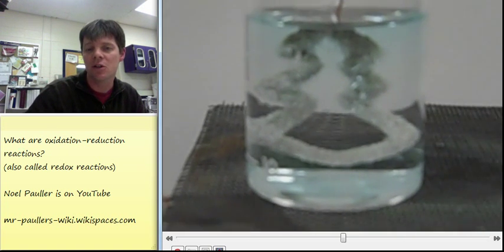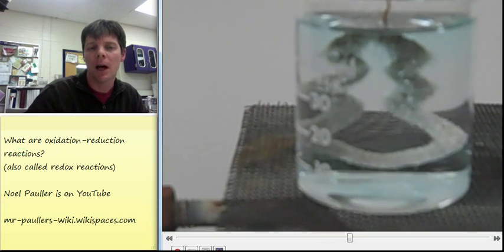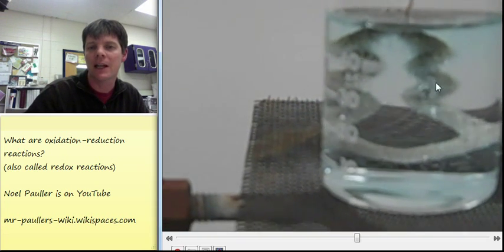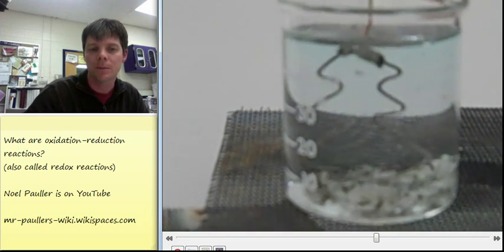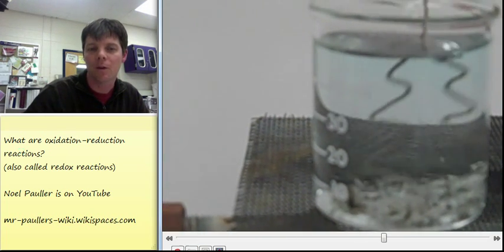Again, this is an example of an oxidation reduction reaction. In just a second here, I'm going to tap here to release the silver. There we can see it sink to the bottom. All right, there we go.